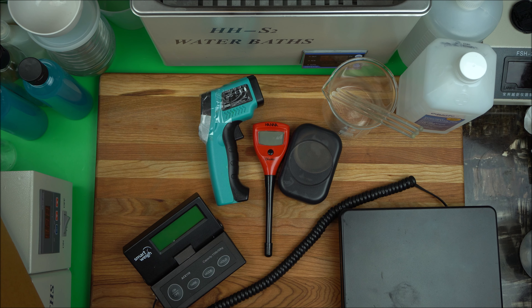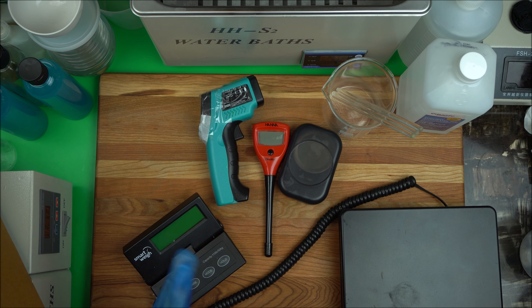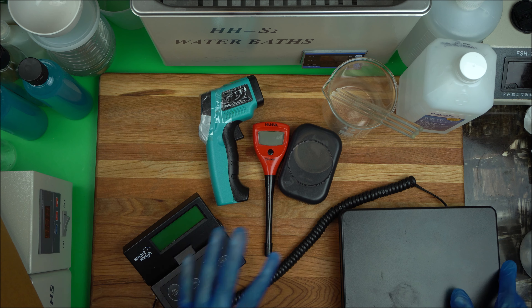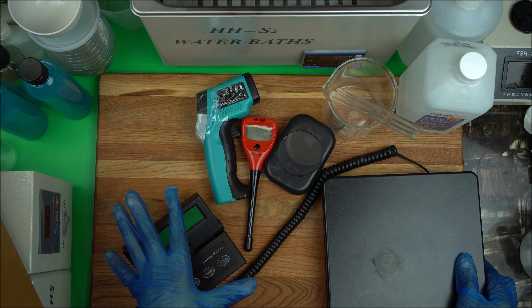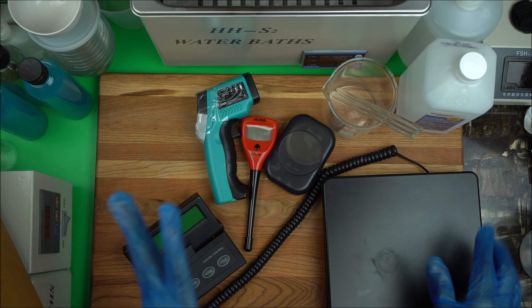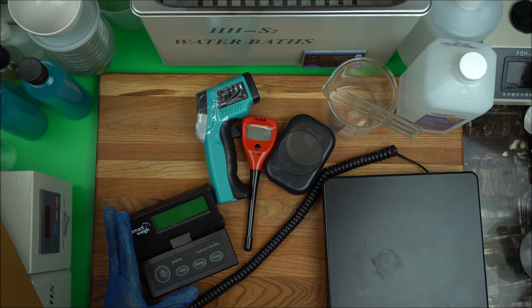Hello everybody, welcome to the channel. In this video I'm going to introduce you to essential tools every formulator should have — whether you're a cosmetic formulator, doing DIY, or making product at home or in a small place. These are essential tools that you must have.